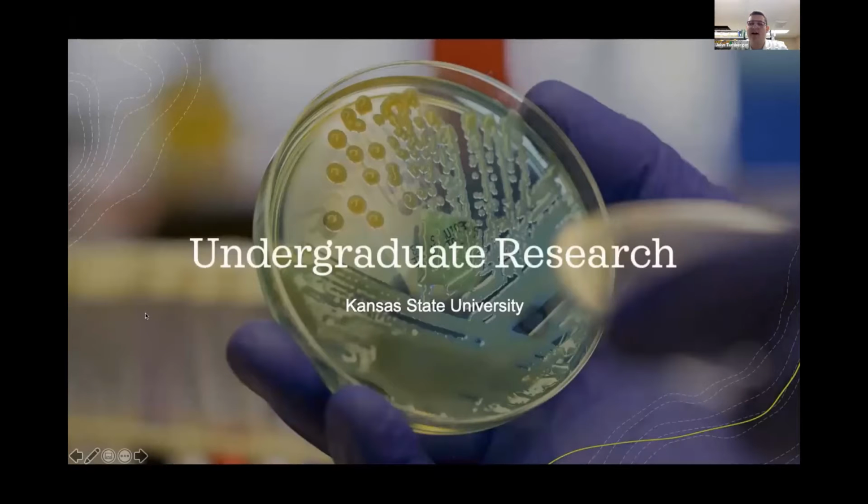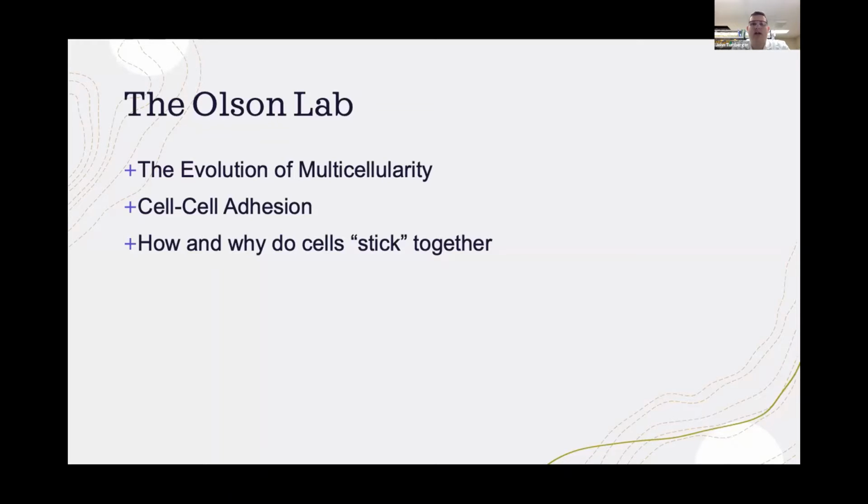Good morning. My name is John Tumburger, and I am an undergraduate researcher here at Kansas State University. First, let me start by introducing the lab that I work in. I work for Dr. Bradley Olson, and we study the evolution of multicellularity. Currently, I am focused on cell-cell adhesion and how things stick together. We use the volvocine algae as a model organism system. I particularly work with Chlamydomonas reinhardtii, Gonium pectorale, and Volvox carteri.